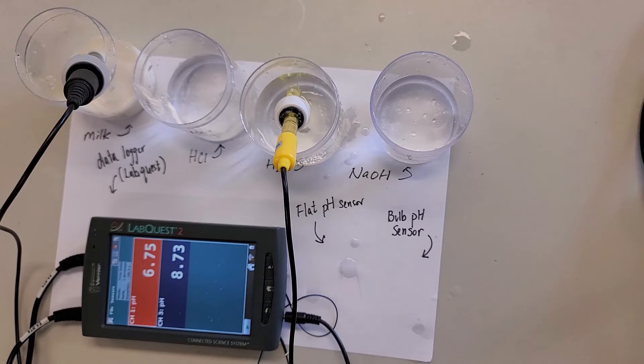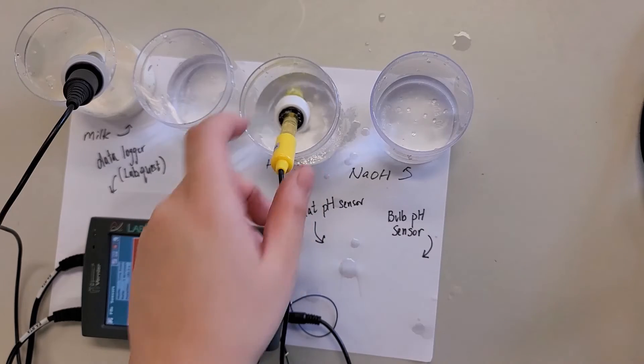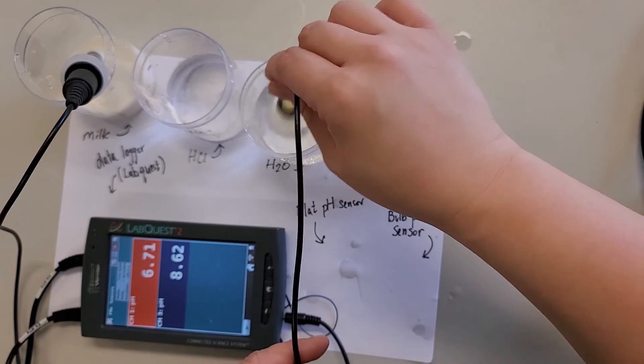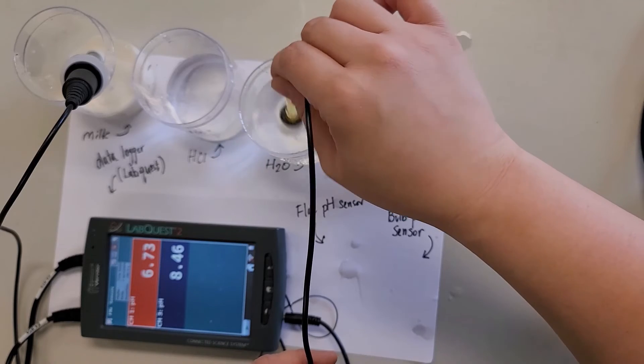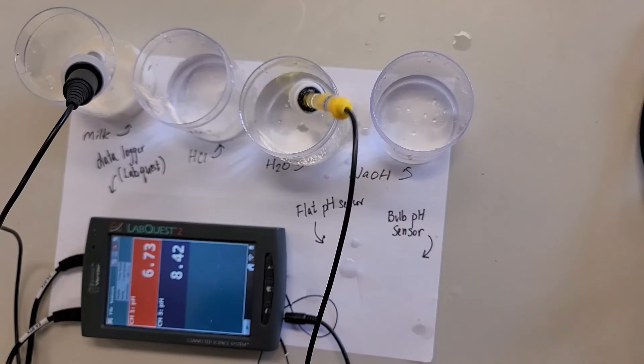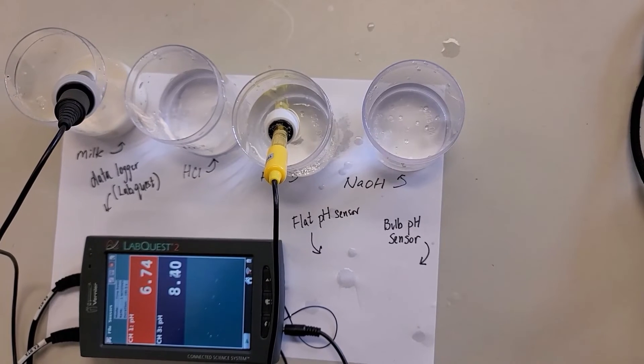All right, so now you can see that the bulb pH sensor is detecting water. I need to allow some time for it to settle down for a bit. You can see that it's actually dropping.